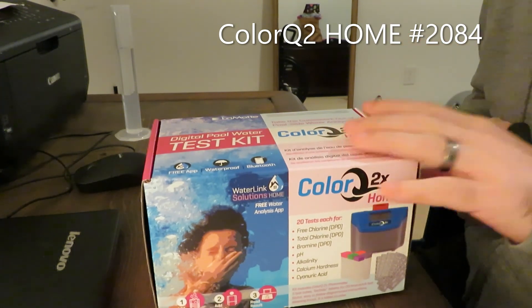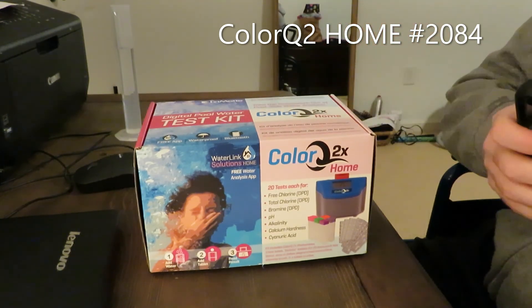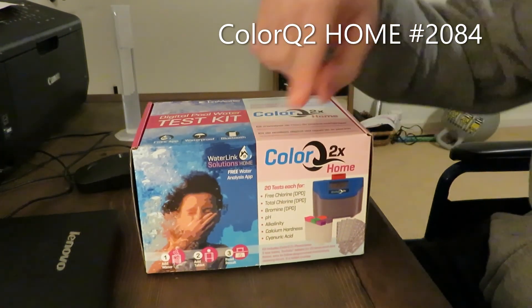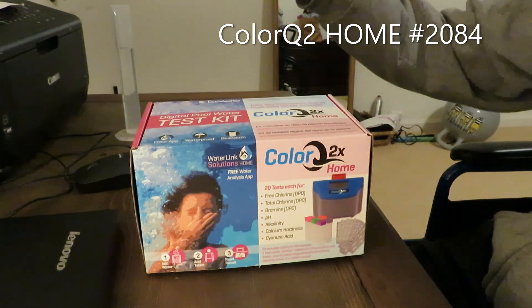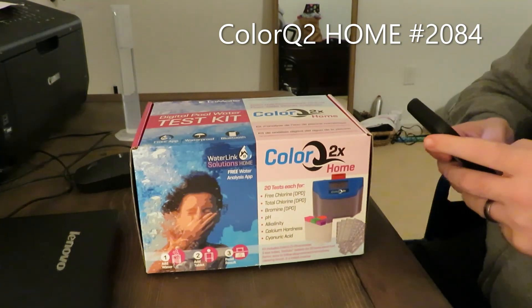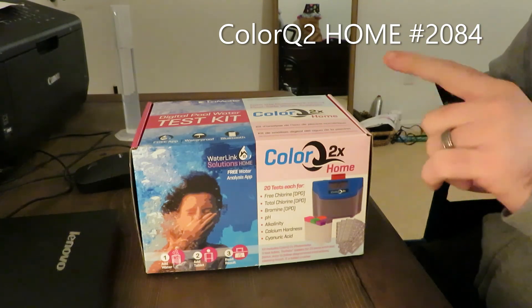Overall, I found this product to be very accurate. I checked the results with two different other testing kits and also strips, and they were right on — very good. For usability, it could be a little easier. If I was doing this every day, I would probably take all six tubes, fill them up to the correct line, put all the reagents in, crush them all at the same time, and test one after the next. That would be the easiest way. But it is packaged well and it's a very reliable test.